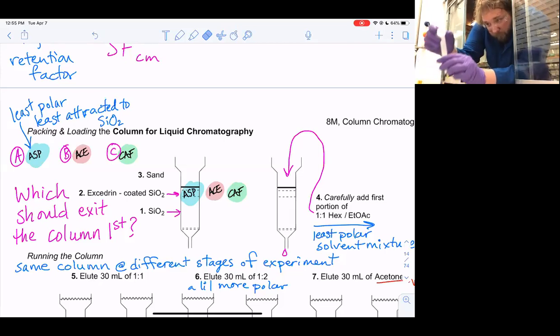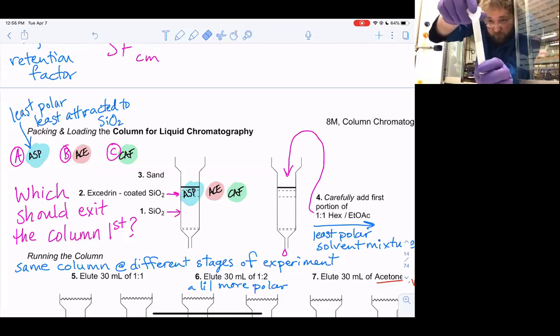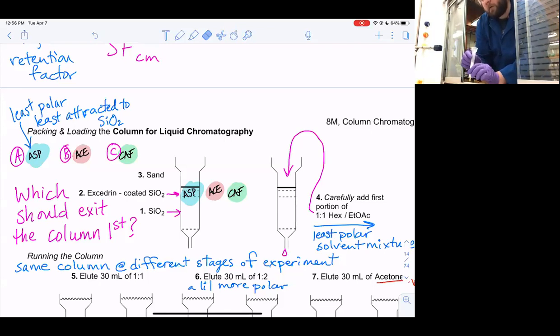Take a look at that. So I would say that that is probably good. You can see the dark sand layer on the top there. We just want to make sure that that is fairly consistent all the way around, and that we're not seeing any white poking through. So I'm going to take a quick look on the top here. And that looks like I just need a small amount more. And that should be fine now.